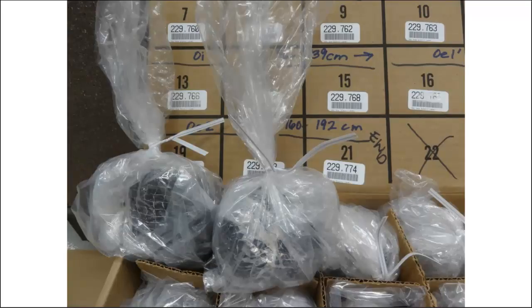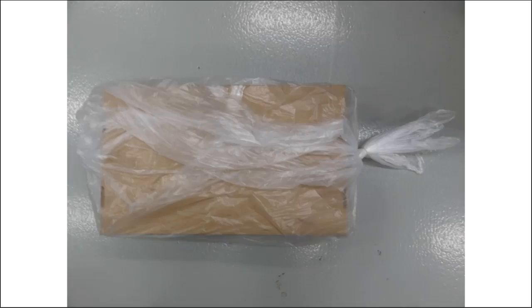But make sure that you're sealing it up with twist ties that we'll send, and also make sure that if there are any empty cells in that clod box, if you haven't filled it up totally, you fill them with paper material or packing peanuts or something like that. And then we put a secondary layer, or a bag, around the clod box, and we will provide you those, and that's part of what we do.